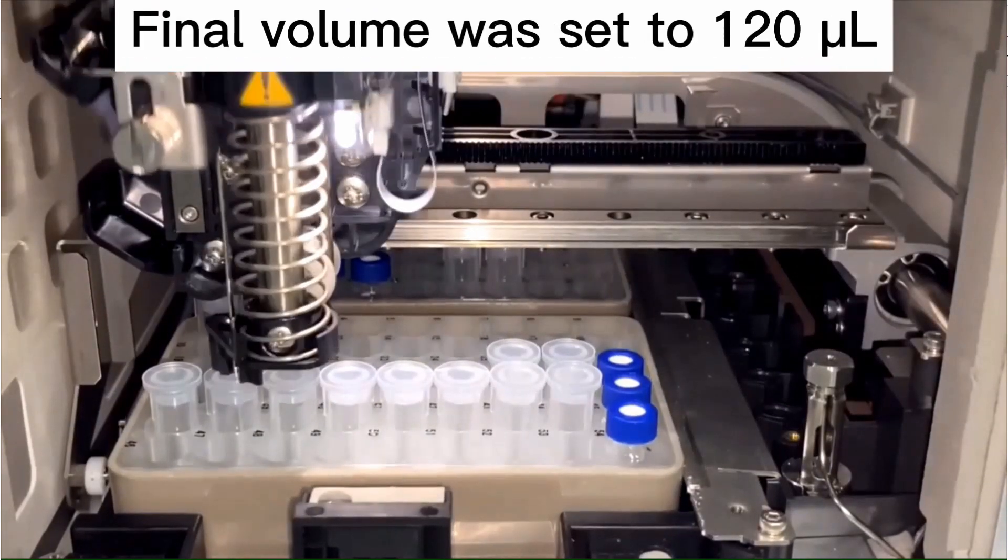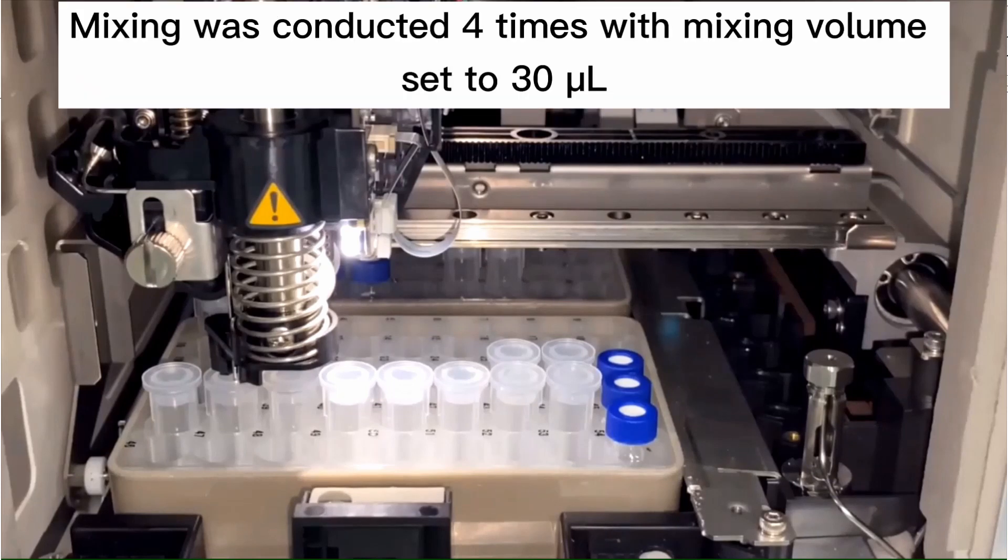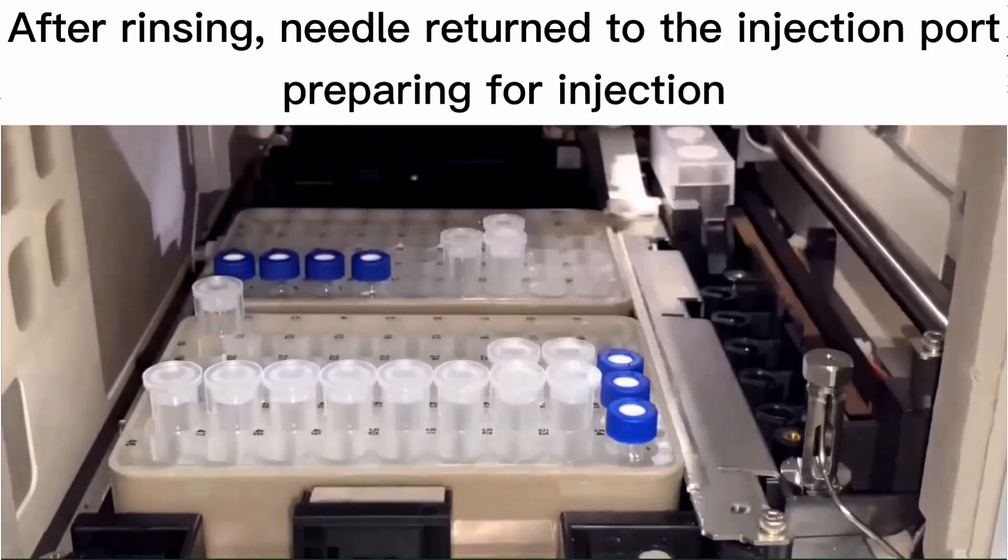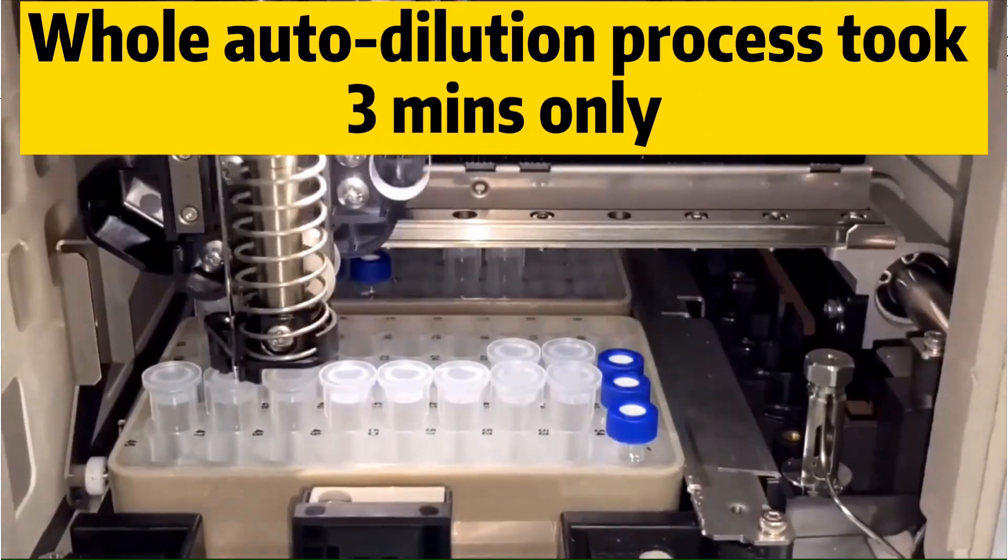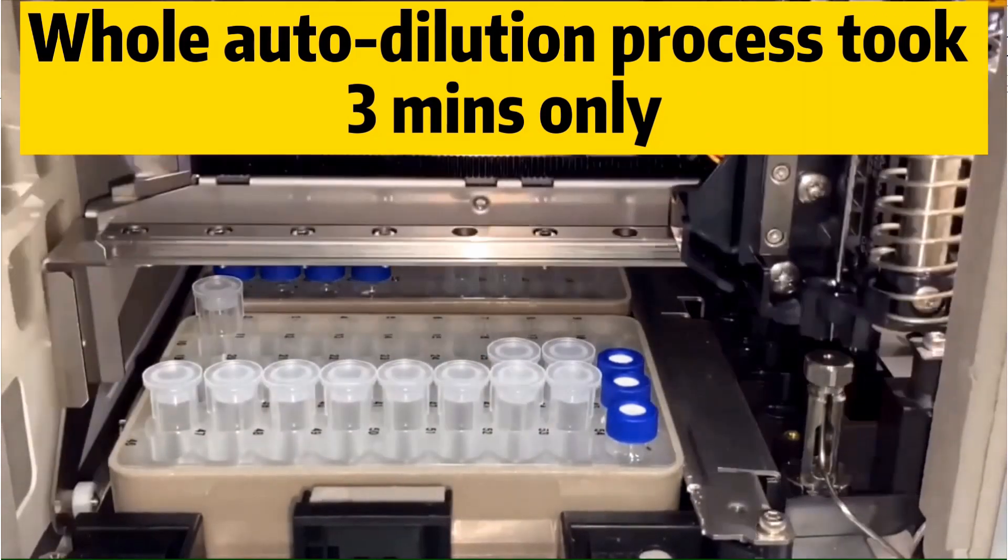Final volume was set to 120 microliters. Mixing was conducted four times with mixing volume set to 30 microliters. After rinsing, the needle returns to the injection port for injection. The whole process took three minutes only.